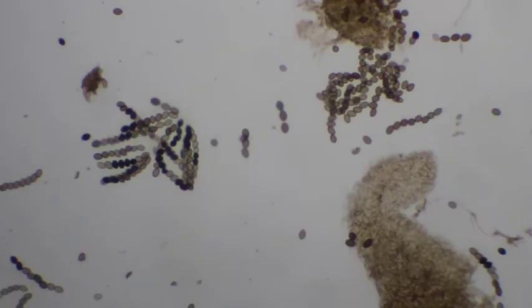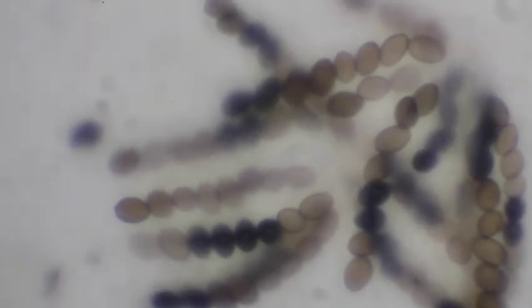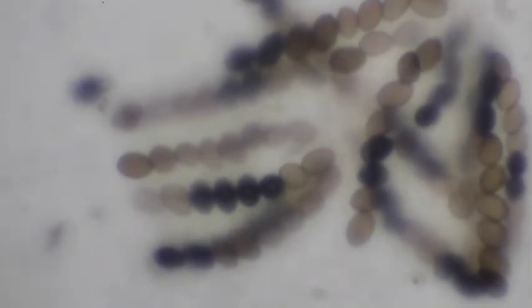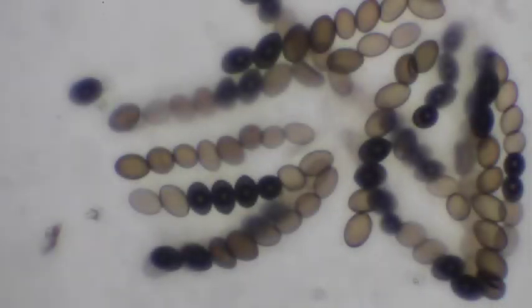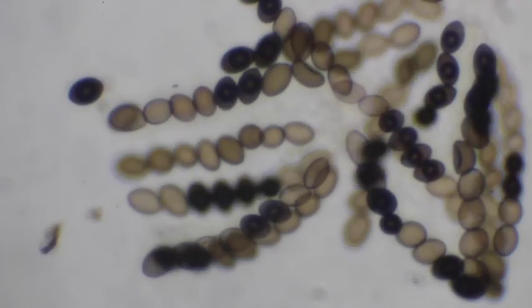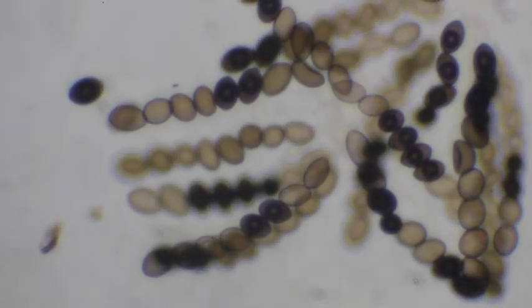Here's a rosette where a lot of them have their color, so we'll increase magnification. We'll kind of move over on these guys here. There we go. Okay, and only ones that we can fully get a count of, we want to count. So there's one good one that we can see there. A lot of these don't fully have their color yet.